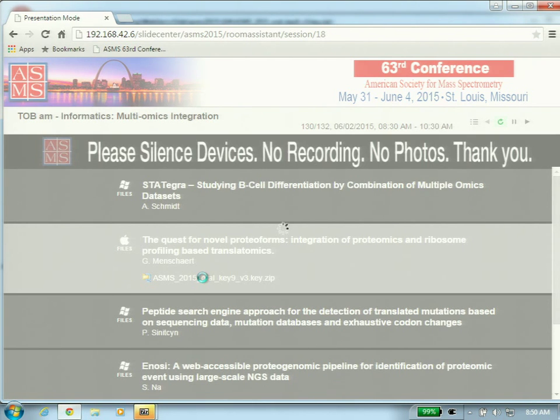I'm going to talk about two different tool sets that we built. One tool set is actually to use this ribosome profiling information and build extra small open reading frames or open reading frames based on that sequencing information. And then another tool set is really focused towards these small open reading frames, where we have extra metrics based on conservation, based on in silico calculations of ribosome profiling information to gather extra evidence that this open reading frame is actually coding.